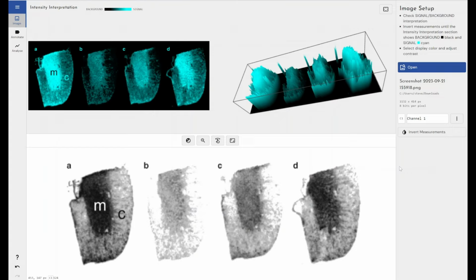People do still use autoradiography or phosphor imaging for 1D analysis. If you are using phosphor imaging autoradiography for that kind of analysis, I would say that the Phoretix 1D software that we offer is much more suited for that. It's much more workflow guided and will get you to your results quicker than trying to perform the same analysis within the toolbox. The benefit of the toolbox is exactly the opposite of things like Phoretix 1D in that it doesn't force you into a particular workflow and you're left with a lot of freedom about your analysis.